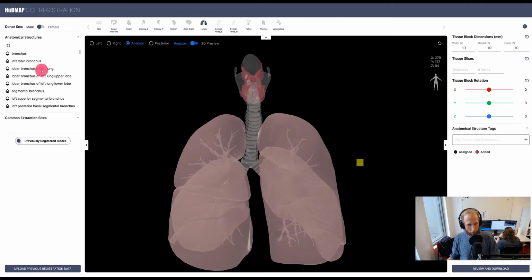In order to turn some of these off, you can hover over this drop icon here, and then you see the slider appear. To make it disappear entirely, you can go to this eye icon and click it, and then it'll disappear. You can actually see that right here, so keep your eyes here for a second. I'm going to turn it back on, and there it is. It's a very small structure, so it's kind of hard to see.